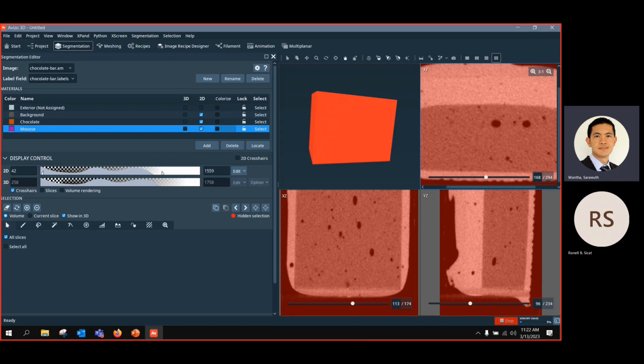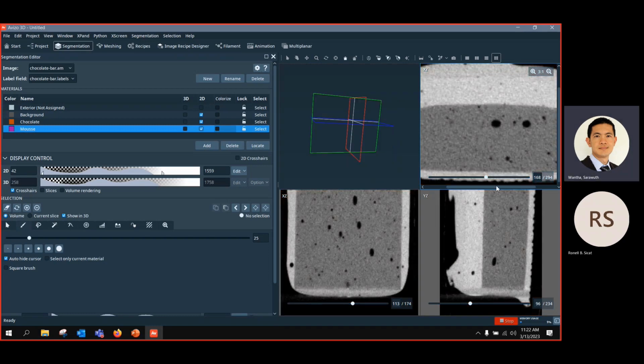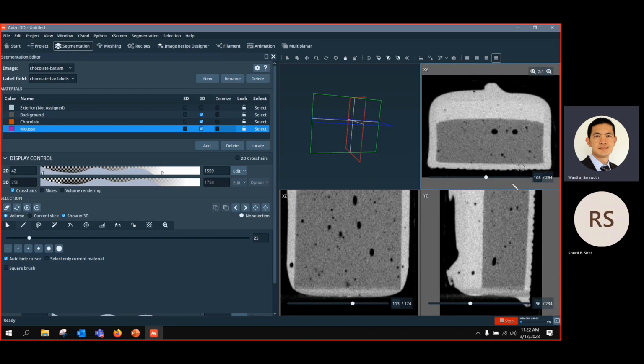Okay, let me show you an example. Instead of using select all, I will start using the first tool, called the brush tool or paint tool here. I first clear this selection, so nothing is left. And I go to, let's say, the XY plane, or you can click any plane that you wish. If I click on XZ, it will activate on the XZ plane. I click on XY plane now, and it will activate on XY like this.